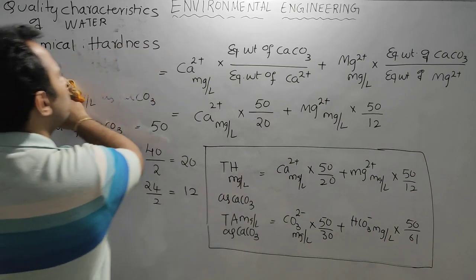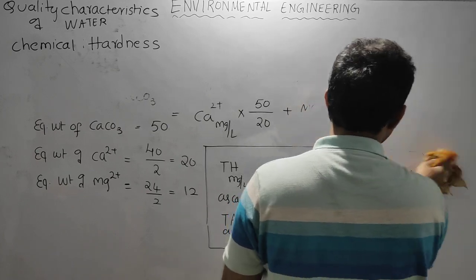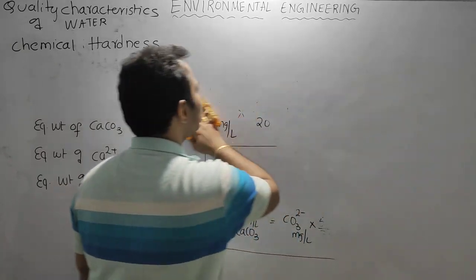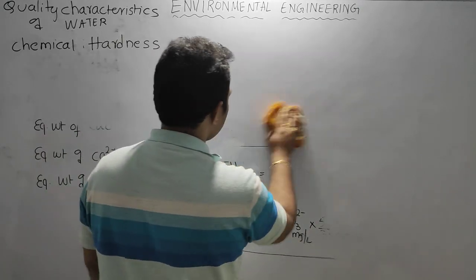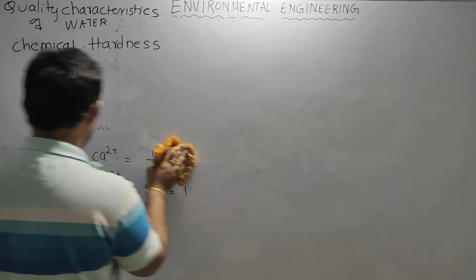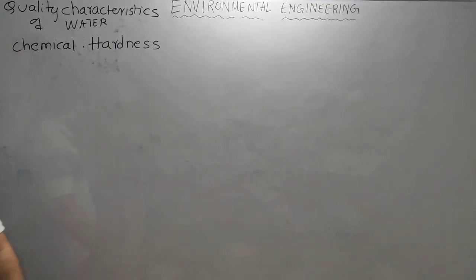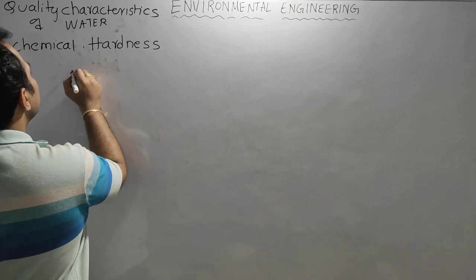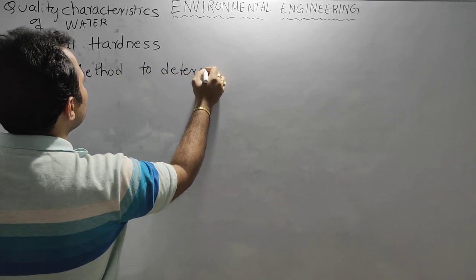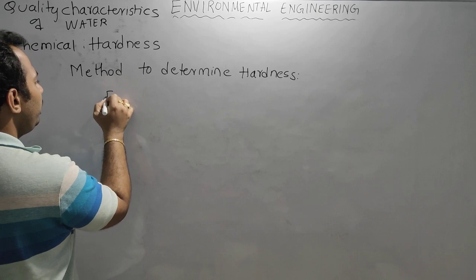The method to determine hardness is the EDTA method.